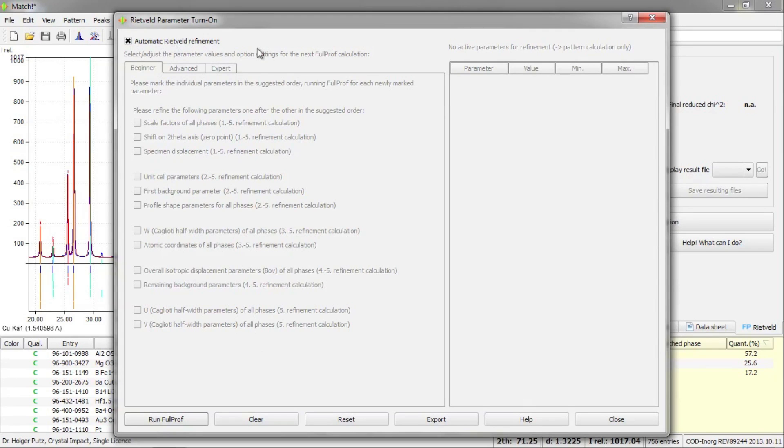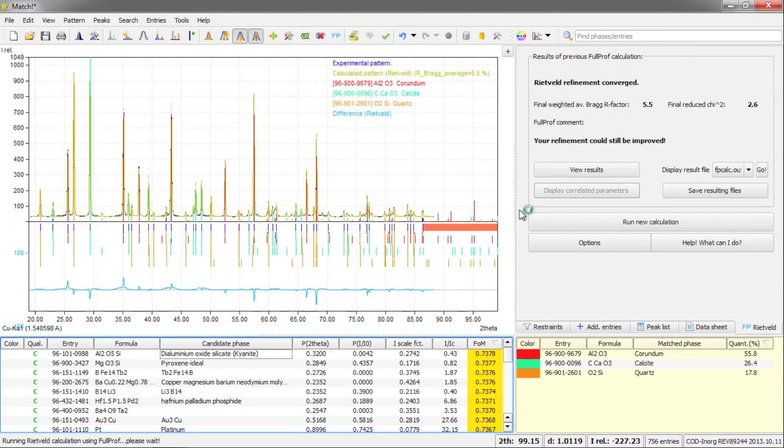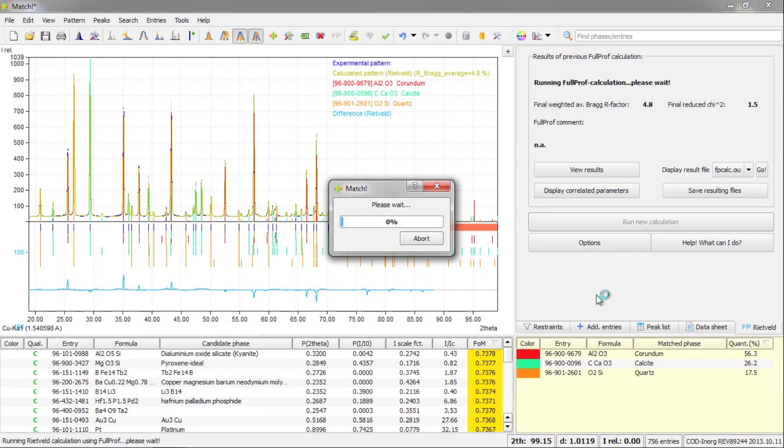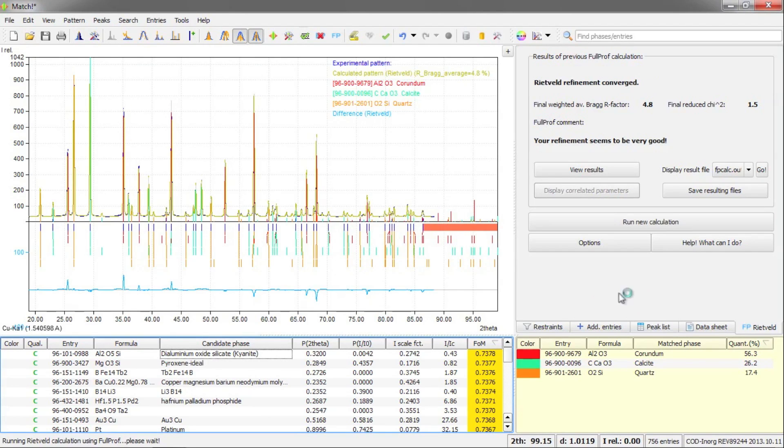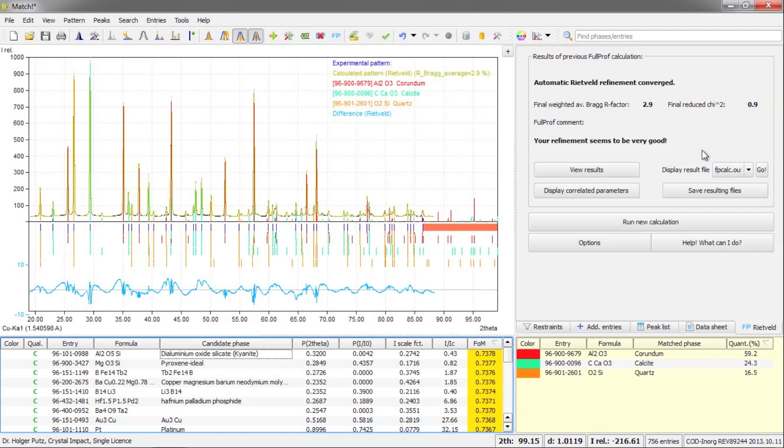So I will just use this one and run FullProf automatically. Here on the right hand side, you can now see the screen has changed. We are no longer seeing this periodic table that is normally used to add some restraints. But now we see the Rietveld tab here in which the progress of the Rietveld calculation as well as the R factor and the comment from the FullProf program are presented. Now the calculation has finished.